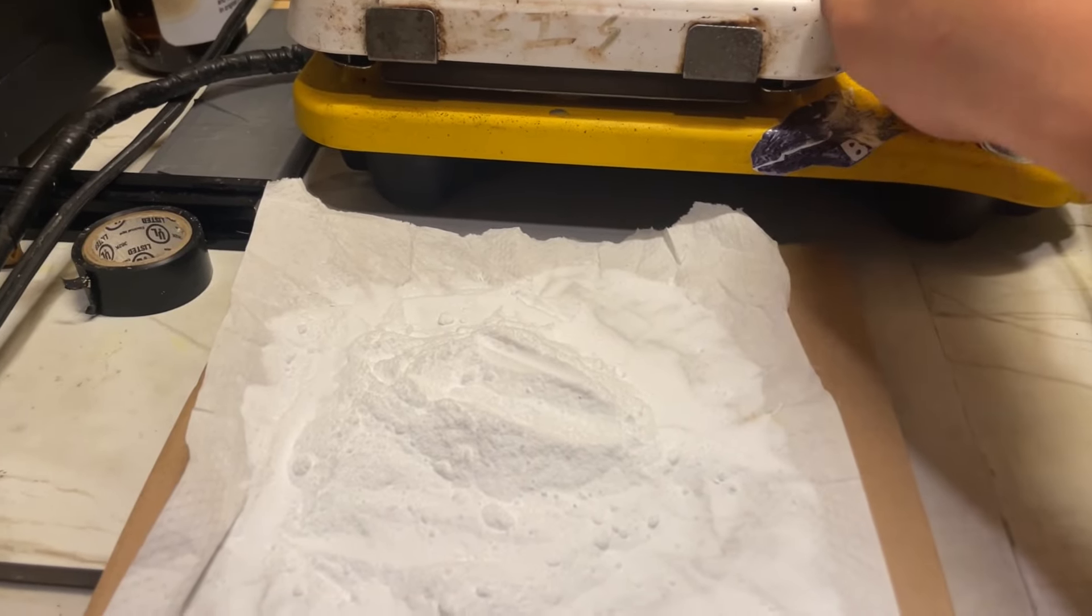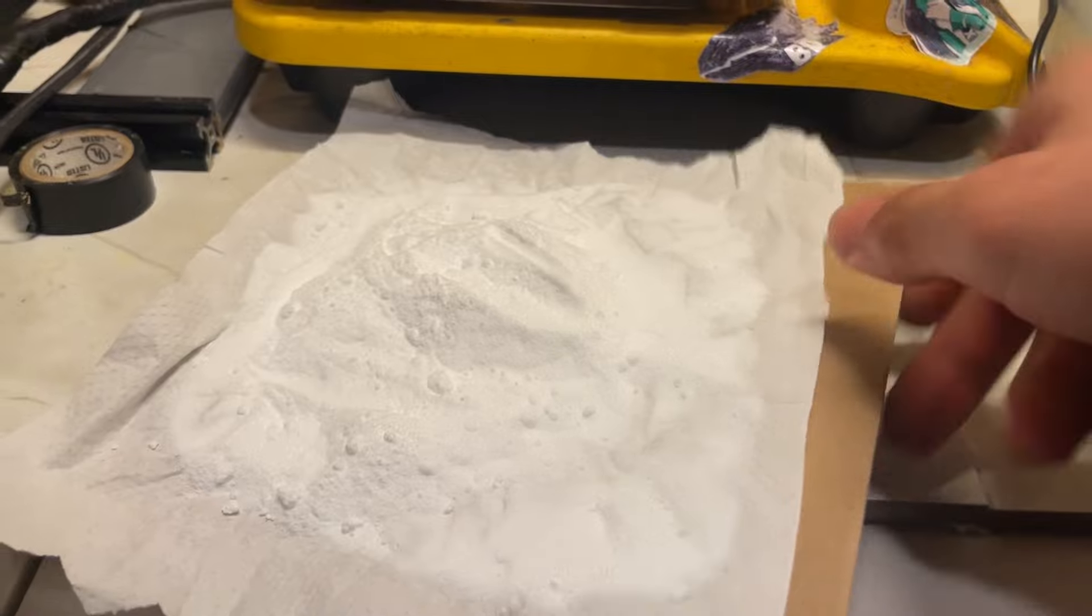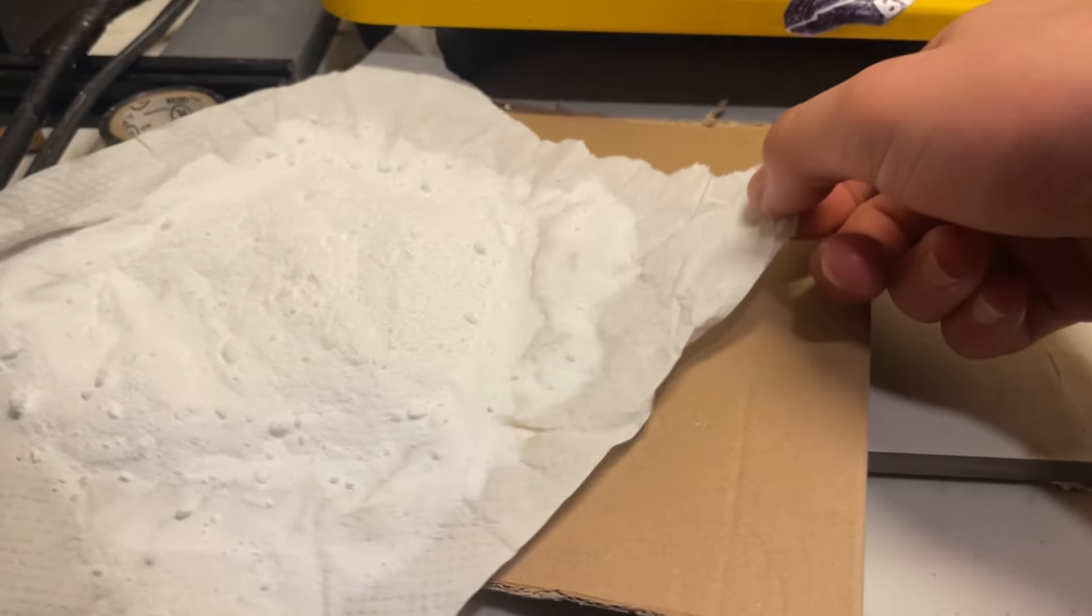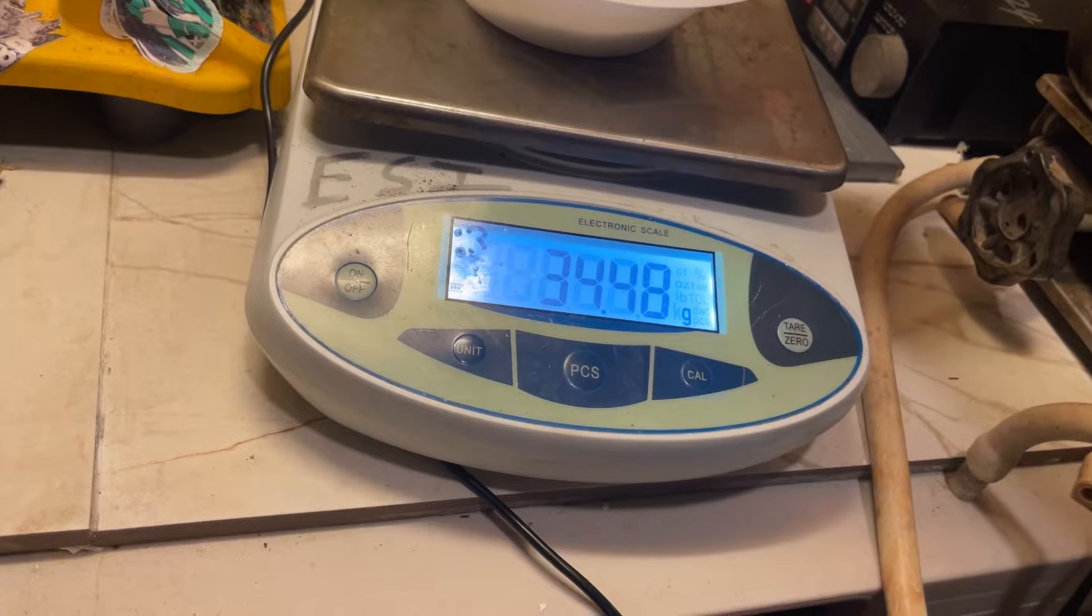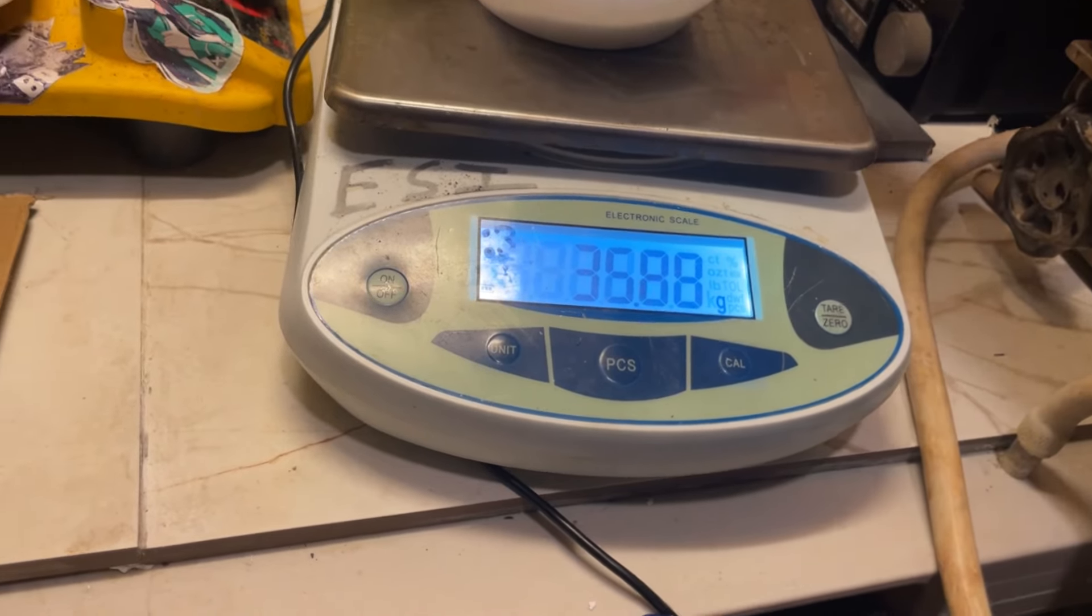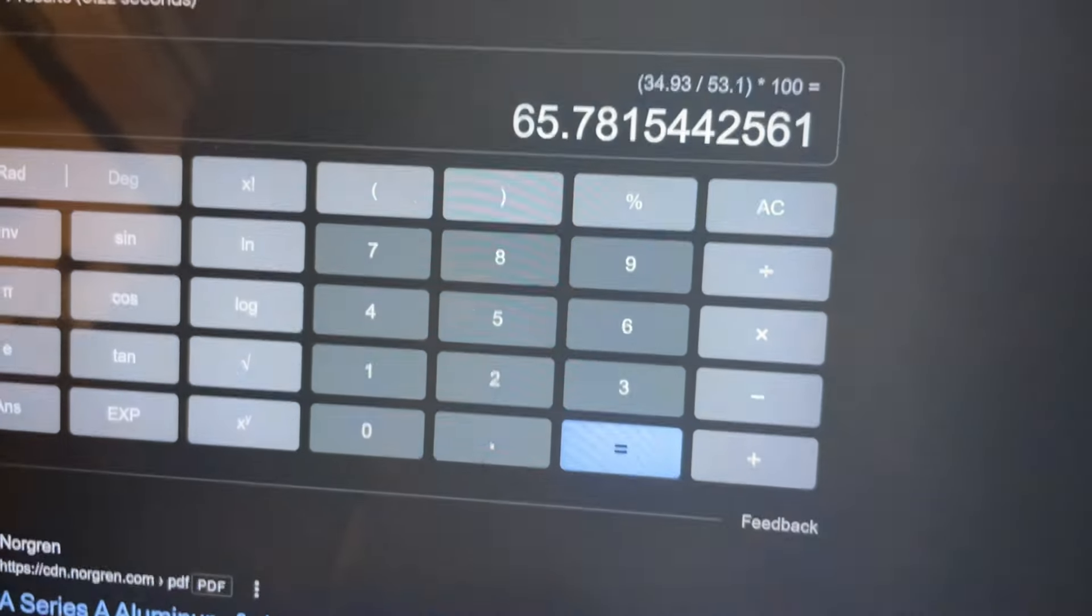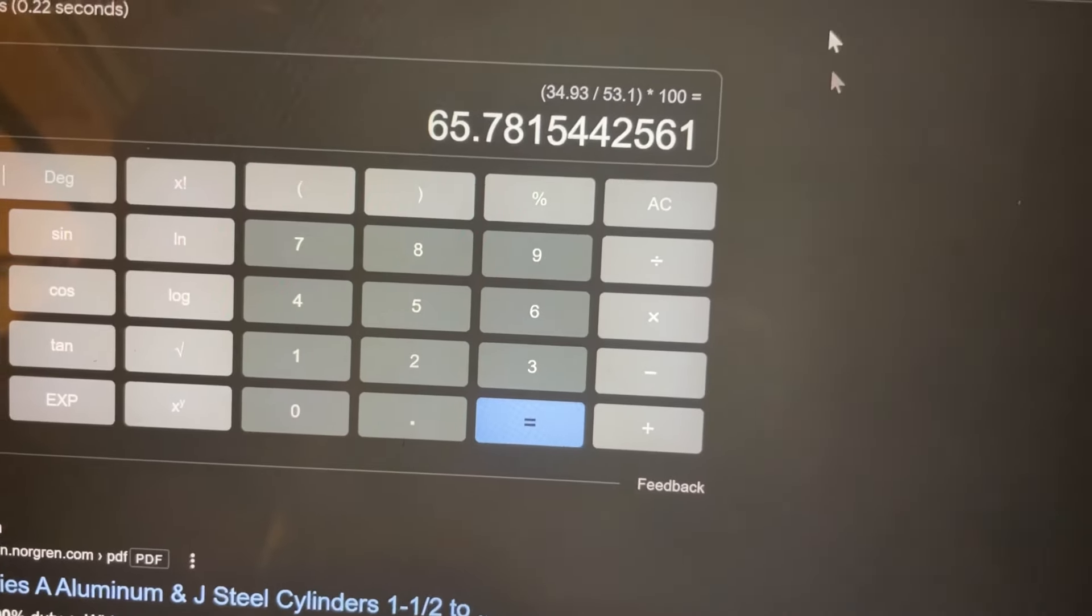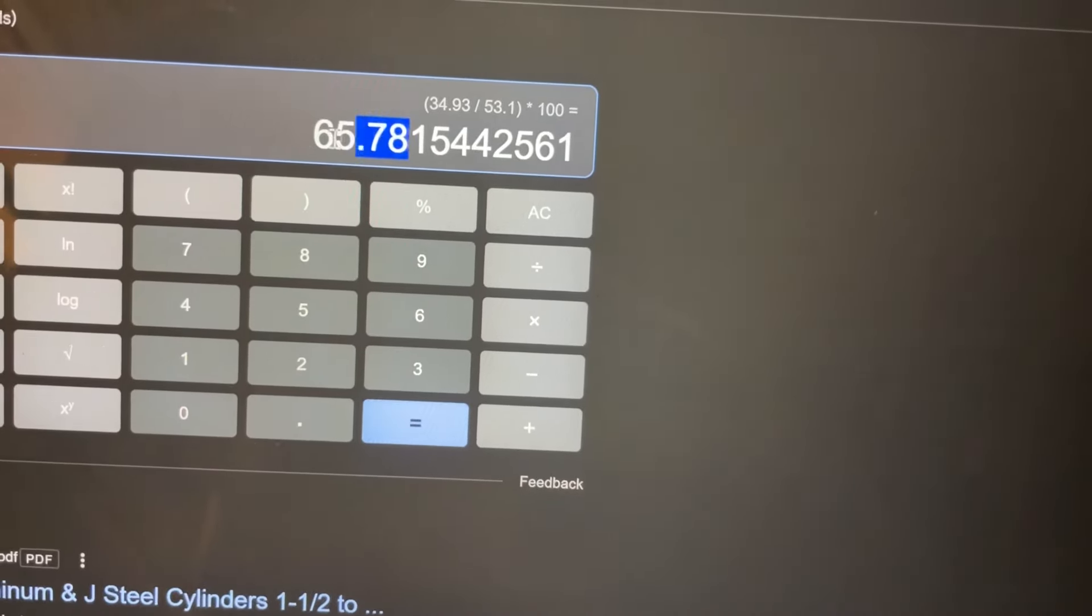Let's see how much we got from this. Oh, how am I gonna pick this up? Don't wanna do that. We have 34.93 grams. We should've gotten 53.1 grams, assuming 0.9 mole urea, which is what it should be. So you have 66% yield.